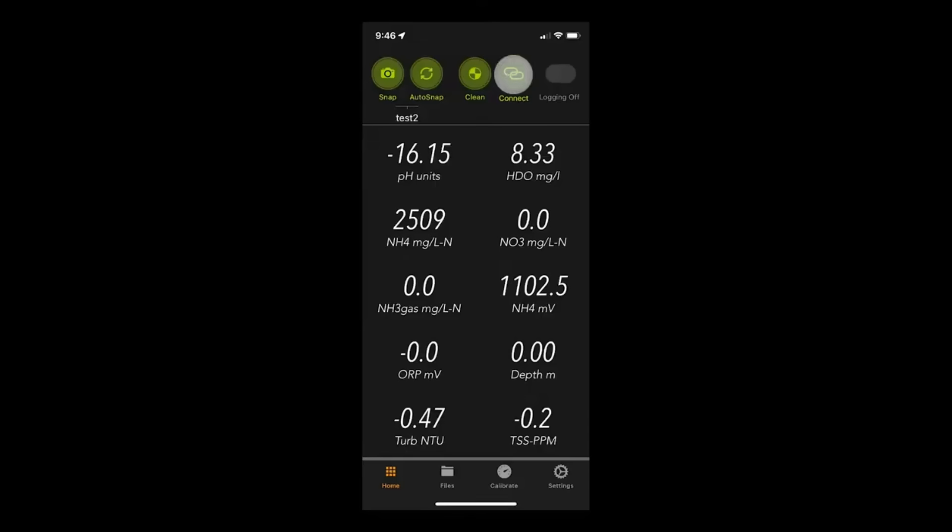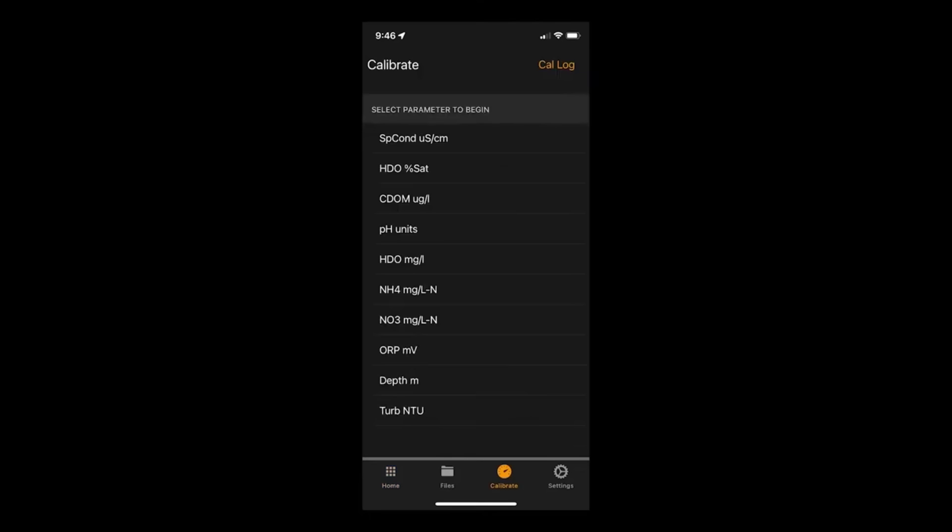Tap connect at the top to connect to your Manta Mobile Bluetooth device. Once you see data scrolling on your home screen, tap on calibrate at the bottom. This brings up a selection of sensors that you can calibrate. Tap on Turb FNU or NTU to calibrate your turbidity sensor.